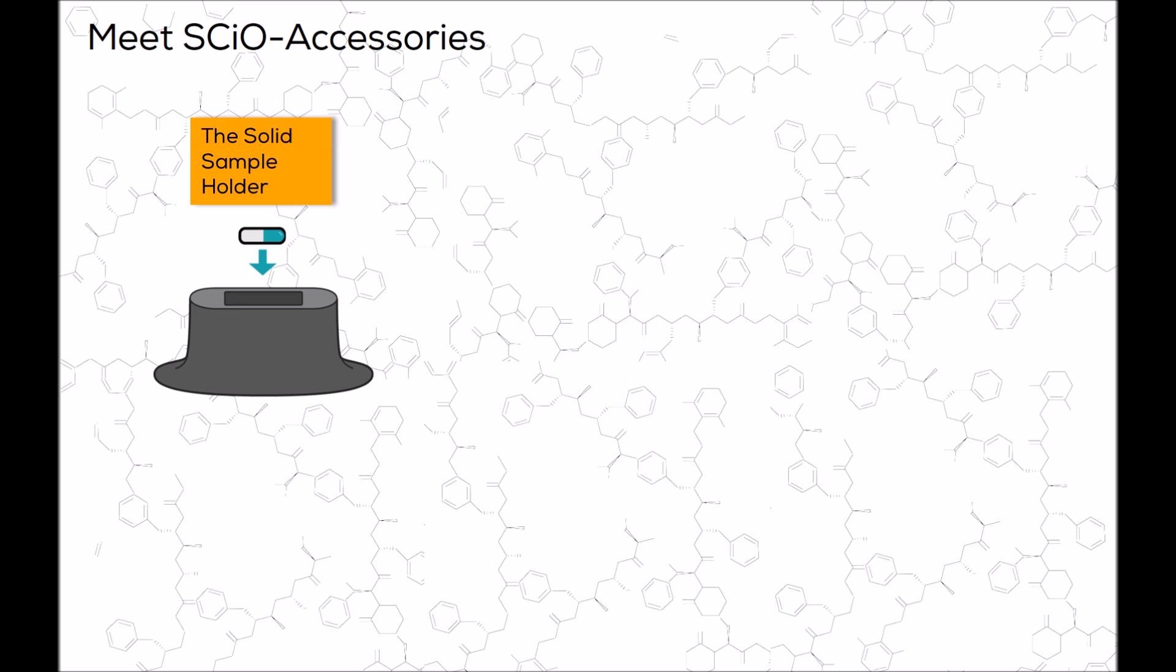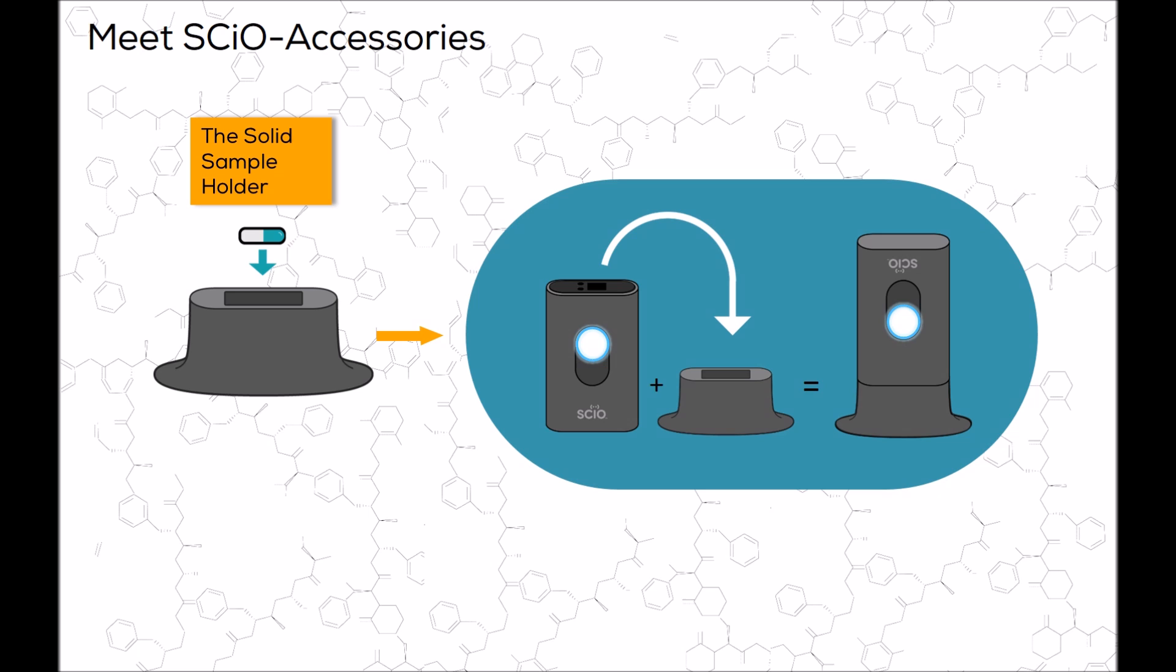The next accessory in your box is the solid sample holder. As the name suggests, this holder is to be used with small, completely solid, dry samples. Place the small sample into the holder cavity, and then place your SCiO on top of the holder, with the sensor facing into the cavity. Built-in magnets will hold it in place. To scan, tap scan within the SCiO lab app, or press the SCiO function button.